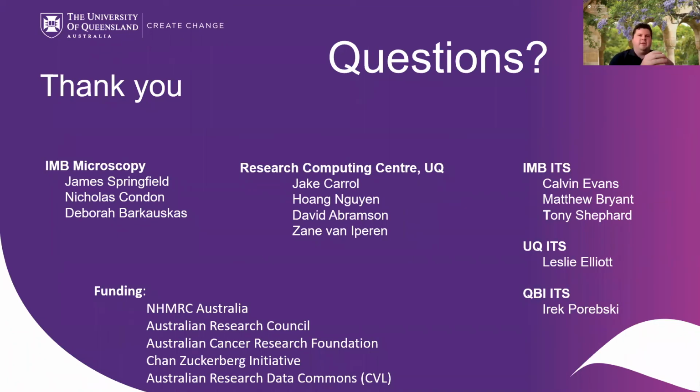So they generally don't change for our users, but for a few fringe cases, they will change so that we have that flexibility to add. It's something that probably could be predicted because we have an algorithm that calculates what one is from the other. So that's just more tools that could be automated in the back end, but hasn't been a major priority because no matter where you are, if you're doing lattice processing, they're numbers that you're going to deal with from that device.